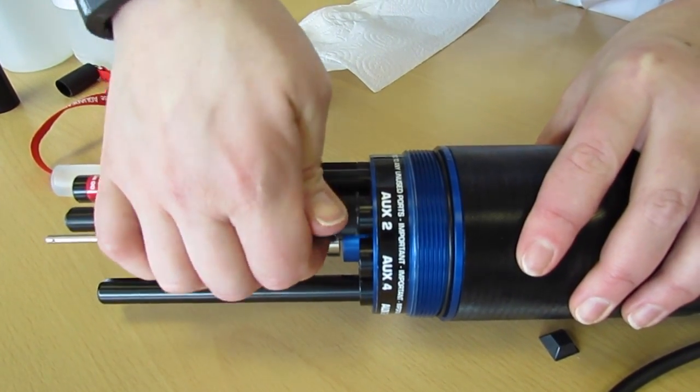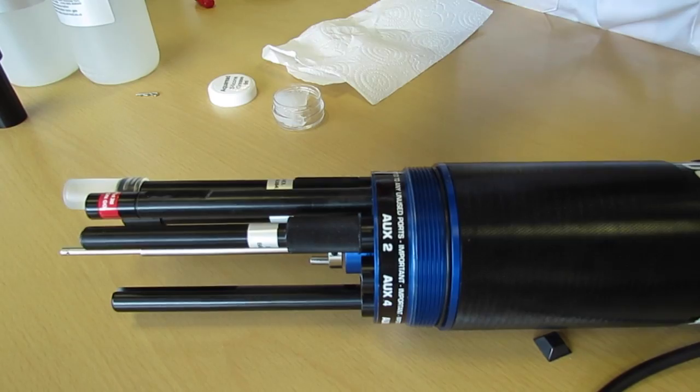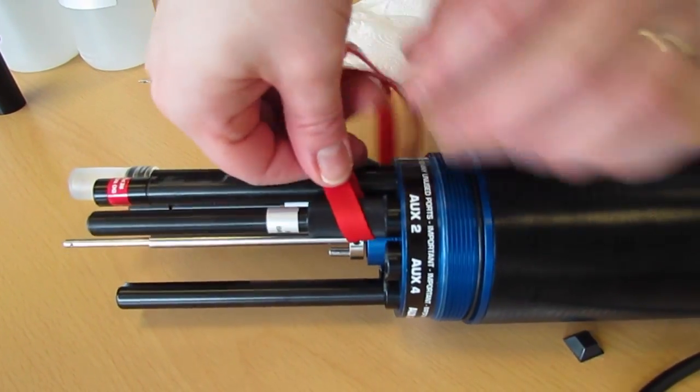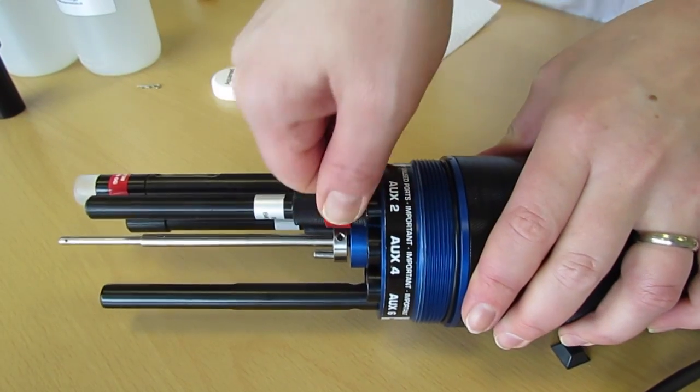This needs to be screwed down as tight as possible by hand. Take the red lanyard, put it over the electrode, and tighten up as much as possible.